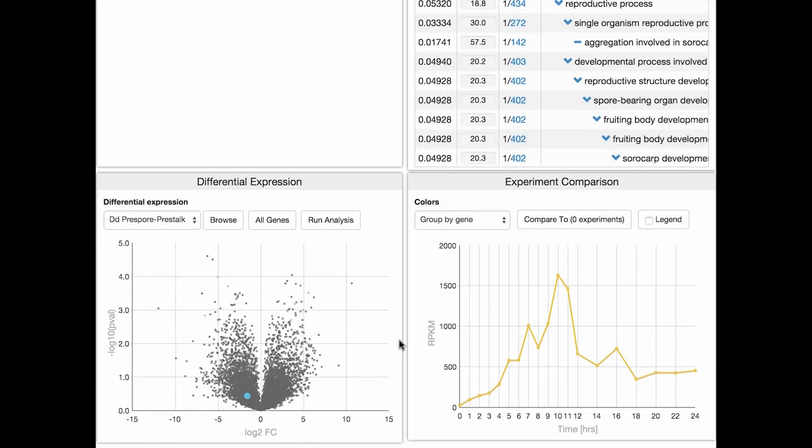Differentially expressed genes are visualized in a Volcano plot. We can see here the CARA1 gene marked. In the Volcano plot, the X-axis measures the fold change in gene expression.